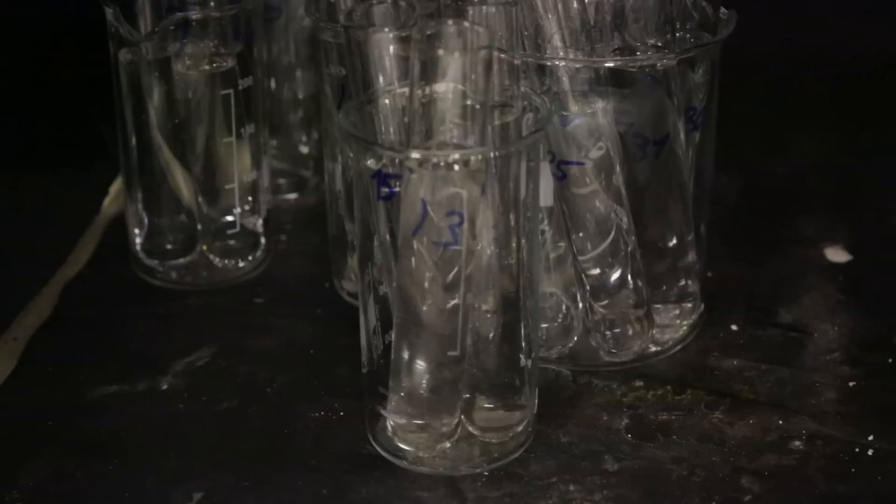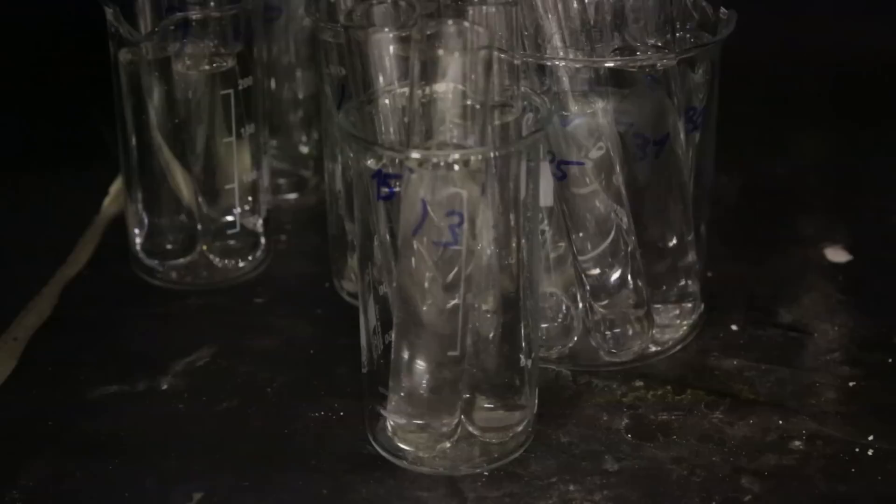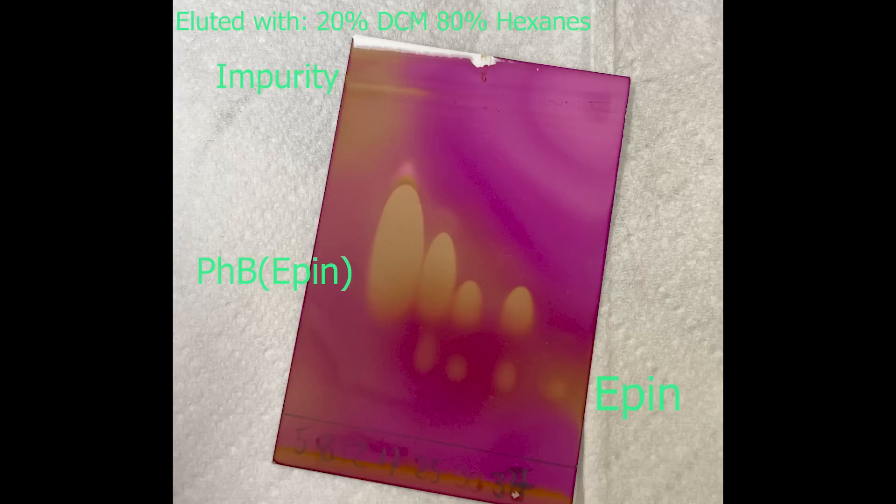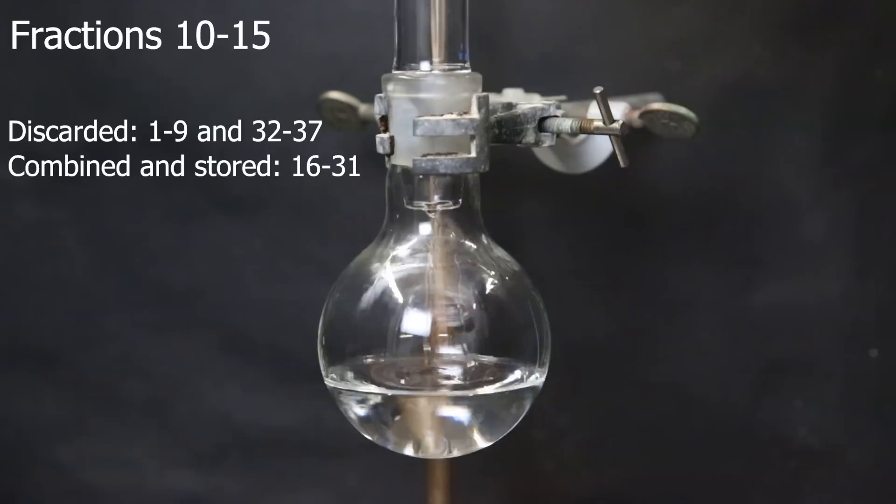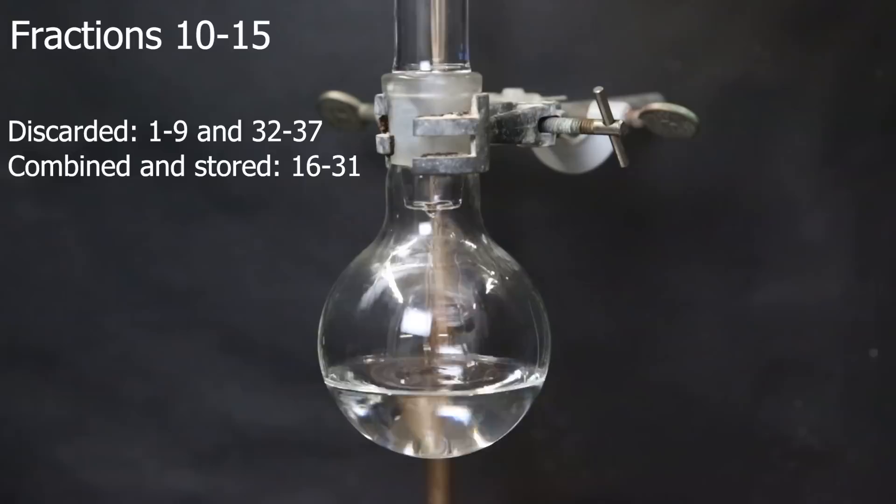After about a day of running, I collected 32 fractions, there are approximately 40 to 50 mil each, and 5 larger fractions at the end. The interesting thing is that some fractions respond to 380 nm UV light, which might indicate something, but we have to check it with TLC. When I shine them with the UV light, they start glowing blue, but this doesn't happen to many of the other fractions. So I TLC'd an assortment of fractions, and we can see that fraction 12 mostly has phenyl B-epin. Fraction 12 is also one of the fractions that was active with the UV light, which was only seen in fractions 10 to 15. So perhaps the large concentration of phenyl B-epin is responsible for this. We can also see that pretty much all of the phenylboronic acid is gone, since it was always stuck at the beginning of the plate, and thus is also stuck in the beginning of the column, which makes for an easy separation. I ran some more TLCs, which I don't have good pictures of, but I decided to take fractions 10 to 15, combine them, and boil off the solvent, since it seems they had the largest amount of phenyl B-epin and were the most pure.